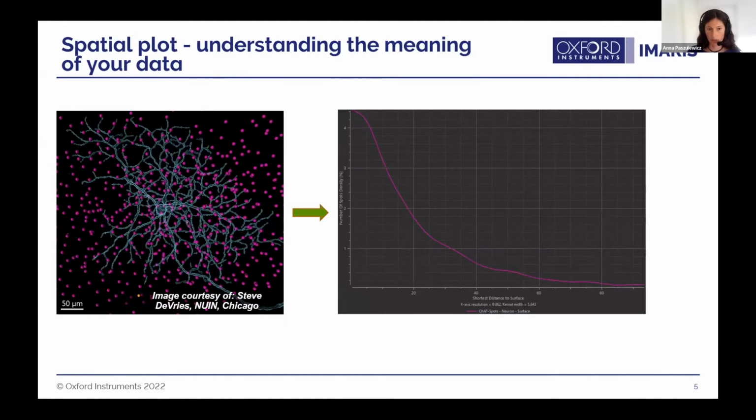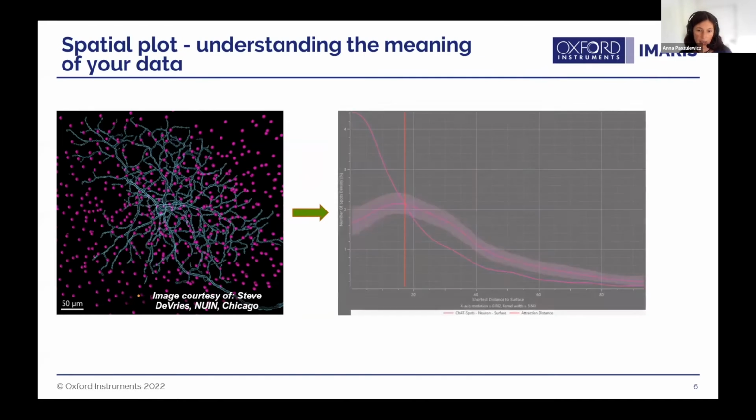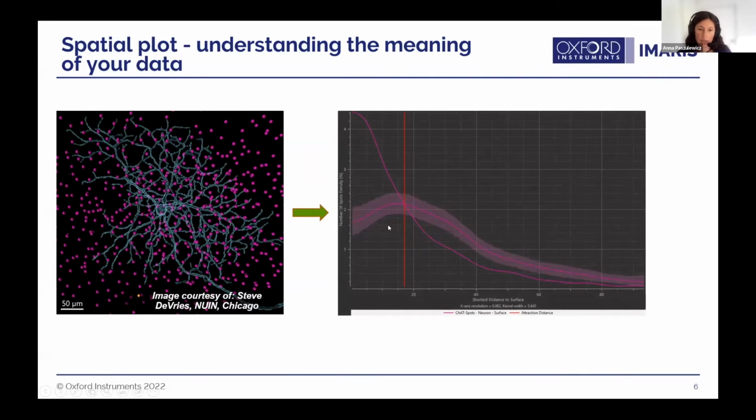Here on the plot, I will briefly present what is on the axes. You see the density of the amacrine cells on the y-axis plotted against the distance from the surface of the retinal ganglion cell. So we can already see that the amacrine cells are more preferably located on the edge and close to the retinal ganglion cell, and their density drops as we go away from it. But this is still just an observation, and all scientists need to compare this situation to some random distribution.